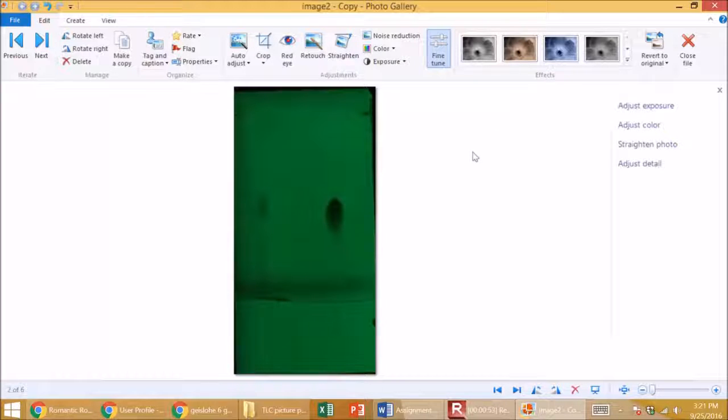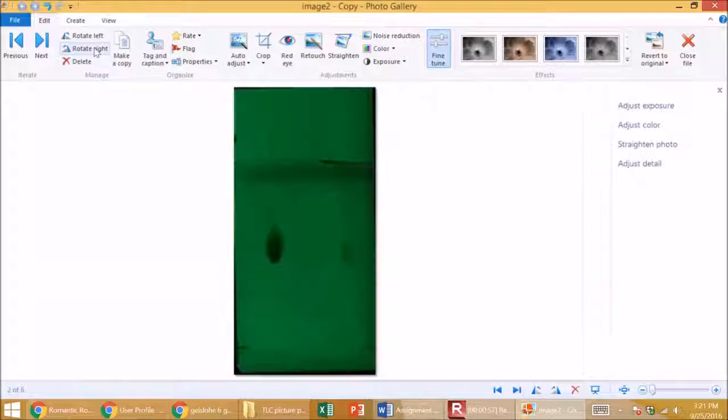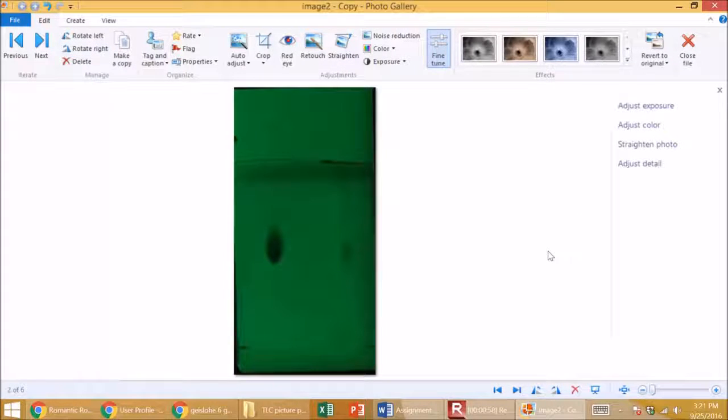A lot of you printed your TLC plates upside down, so I'll go ahead and rotate it. So now this is up. Up is up, that's always helpful.